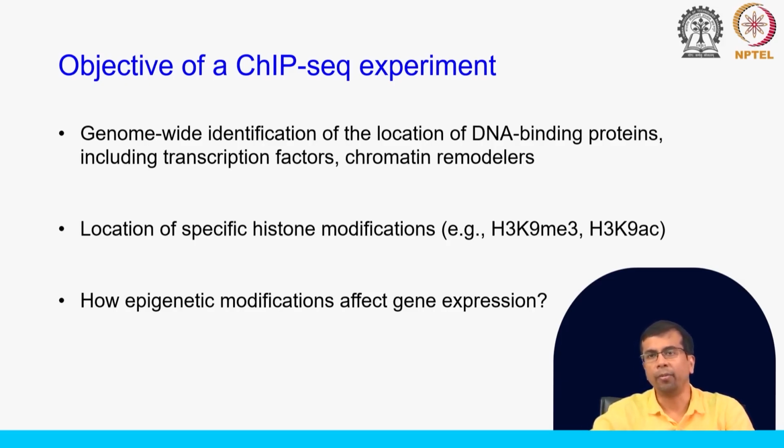We have a lot of gene expression data, but we also want to know how that expression is determined by the binding of transcription factors. For that we do a ChIP-seq experiment, in an unbiased manner for the whole genome.